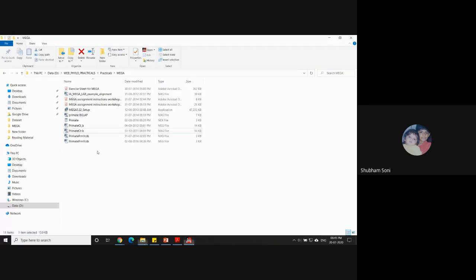Okay, so if I process my file through MUSCLE and then through ClustalW, will I have a difference between both? So till now, I haven't noticed any difference, but maybe the kind of data that we have fed in MEGA doesn't really have any complications that may be created by these methods.